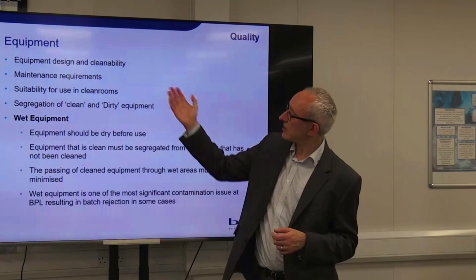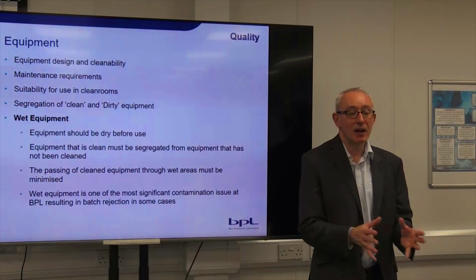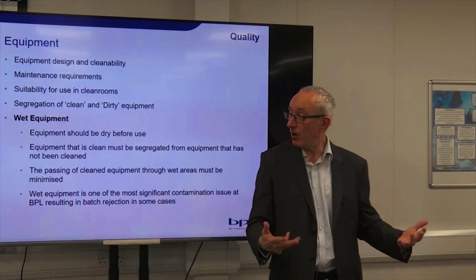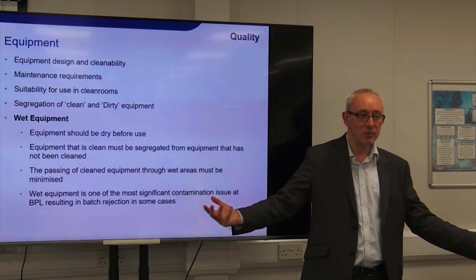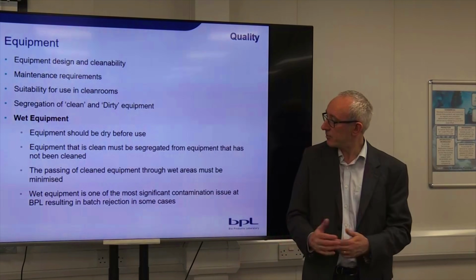So you need to consider things like how easy is something to maintain. If I put this piece of equipment in a clean room, is it going to pump out loads of particles and ruin my environment? Do we have a system in place where we can keep clean equipment away from dirty equipment so their paths don't cross and they're not stored next to each other?